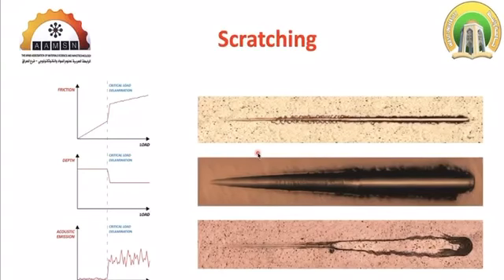So far, we are using a one-dimension load cell. We can exchange this one-dimension load cell for a two-dimension load cell, and perform a scratching test.